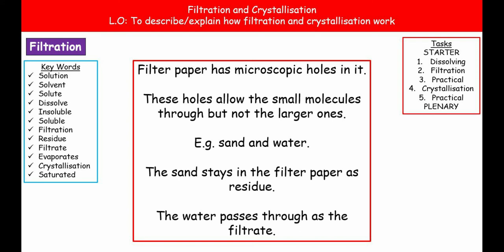So a really good example of this is sand and water. If you mix those two things together, then pour that mixture into your filter paper, what's going to happen is the sand is too big, it won't go through those microscopic holes on the filter paper, so it sits up in the top as the residue.